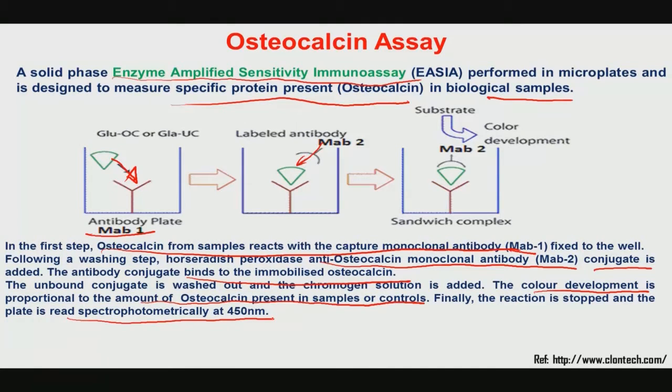So, whatever assays I have discussed so far are typical colorimetric assays, and in each assay certain optical density changes are measured at a specific wavelength using a spectrophotometer.